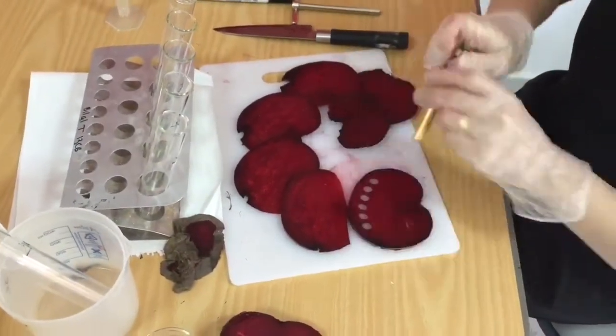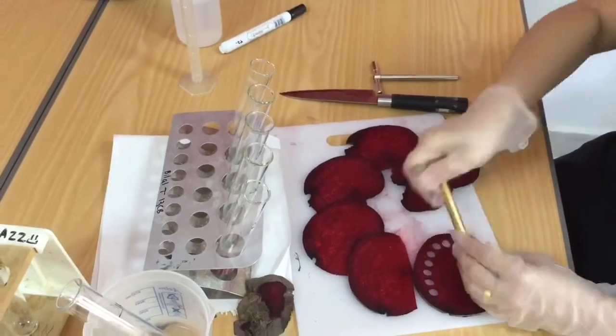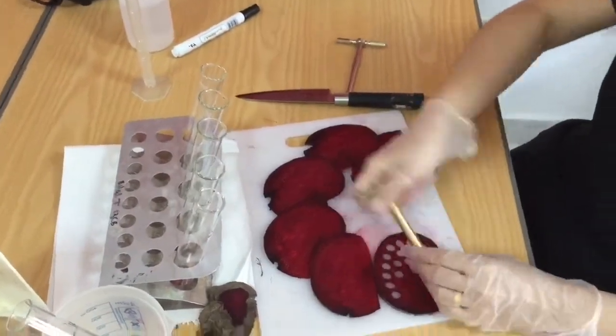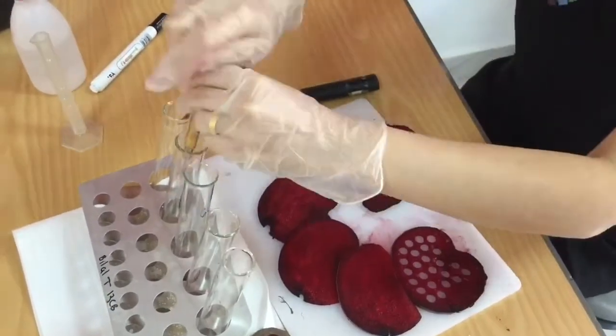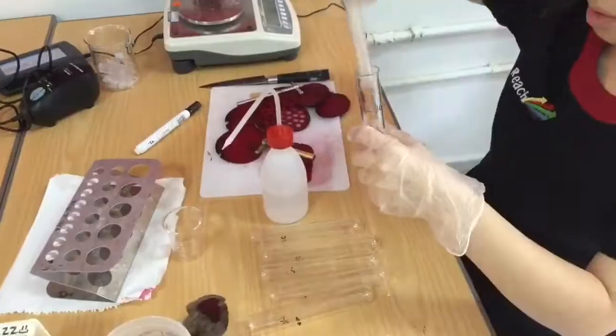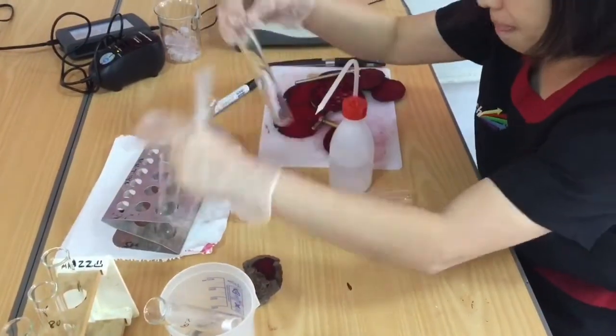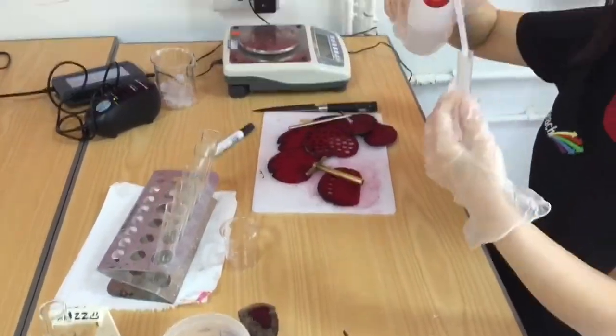Now using the cork borer, I'm going to remove 6 pellets and put them inside a boiling tube, and I'm going to do that for 6 different boiling tubes. Now I've put those boiling tubes with the 6 pellets of beetroot to one side.